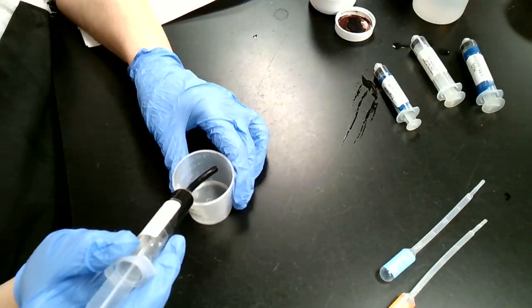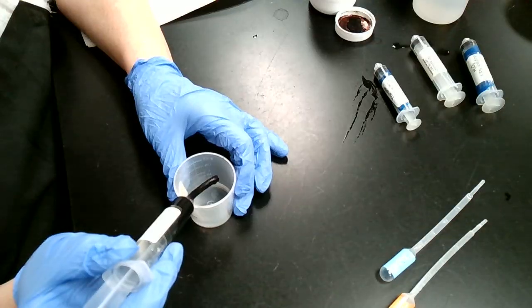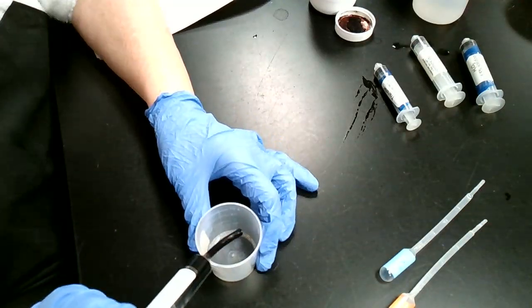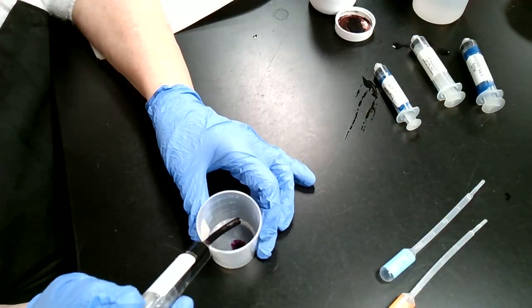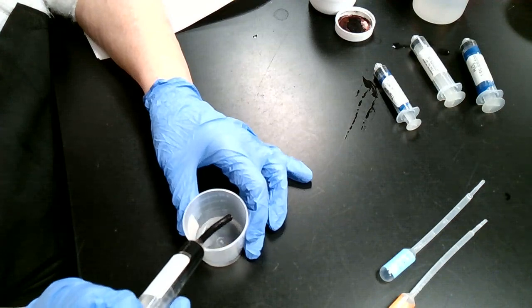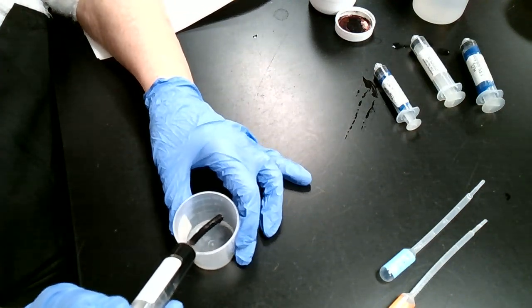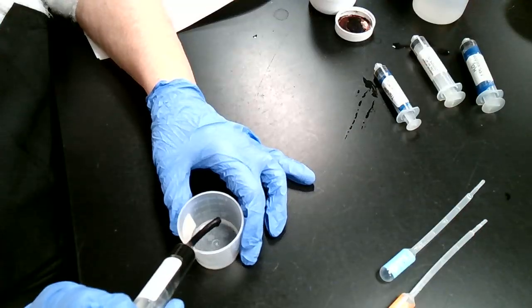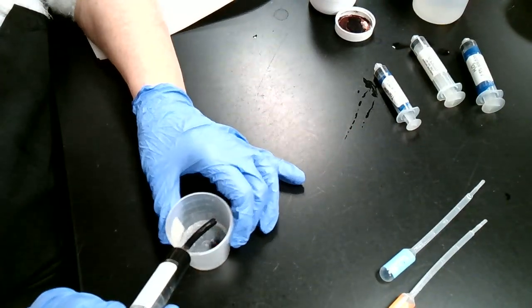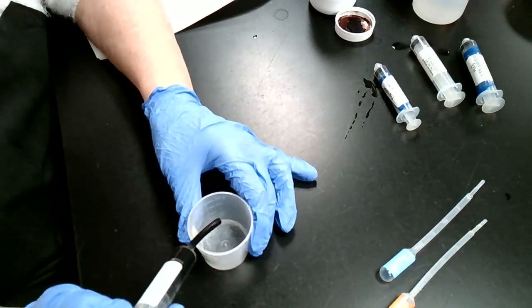And you see how it kind of fizzles and it turns a color at first, but then it goes away. I'm going to put another drop in and see the color goes away. Let's see if you can see that. Good. Okay, put another drop in, the color shows, but then it goes away. And this, you got to be patient, okay? I know I'm going a little fast here. I should probably go a little slower, but I know this one's going to take a little longer. See how the color's there and then it goes away? You want to keep dropping until the color stays, okay?